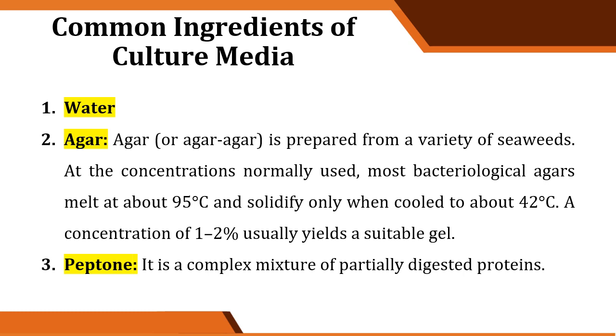So, agar has some very important properties that make it valuable to microbiology. Okay? And no other satisfactory substitute has ever been found. Okay? Few microbes can degrade agar, so it remains solid. Also, agar liquefies at about 100 degrees Celsius, or the boiling point of water, and at sea level remains liquid until the temperature drops to about 40 degrees Celsius.